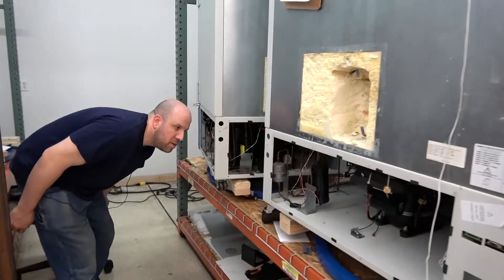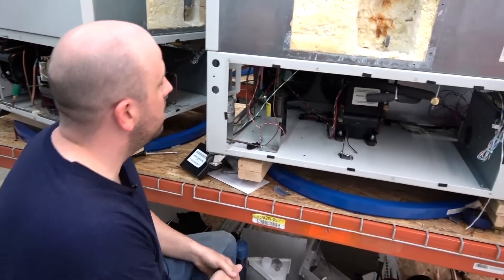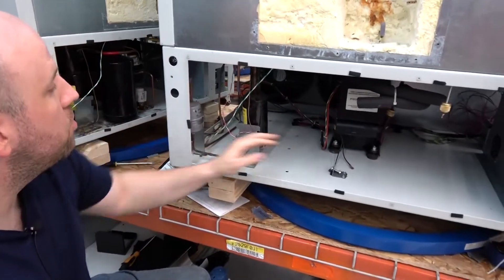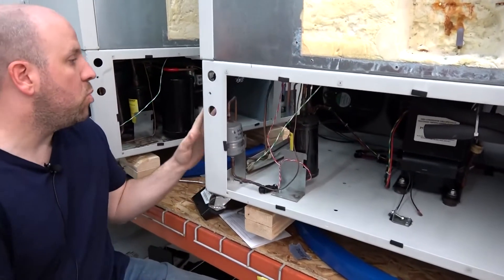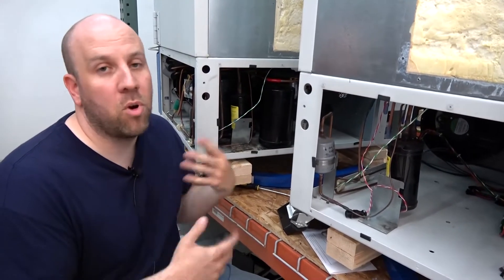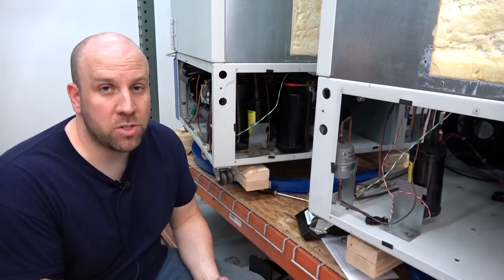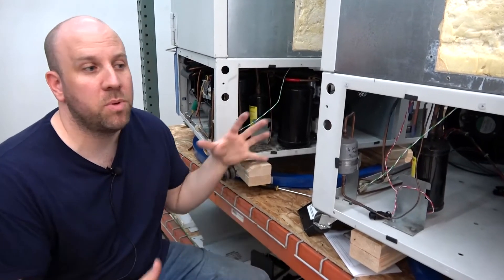This is typically what it'll look like when we're done. We'll go ahead and clean this up real good. Then at this point, the components are all ready to be put back in the system, brazed in. We do a pressure test at that point to make sure there's no leaks from all the brazing we did and all the components in.